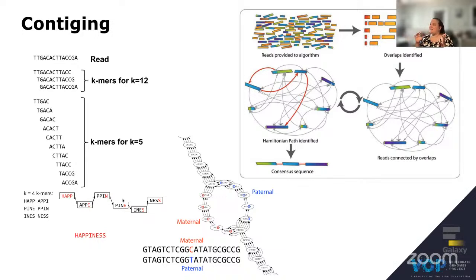And when you have a variation, SNP or heterozygosity in your graph, you're going to find yourself with this bubble, because suddenly you have two paths, two different k-mers, and this is going to be the size of the k-mer, because it's going to be one base separated every time.